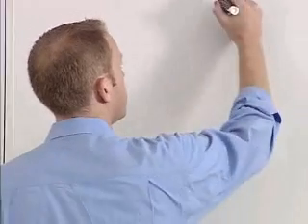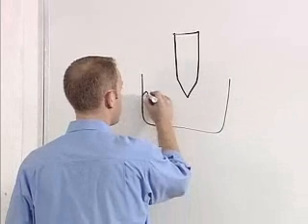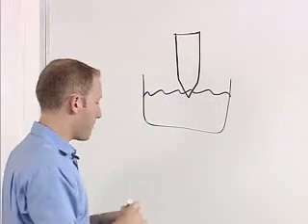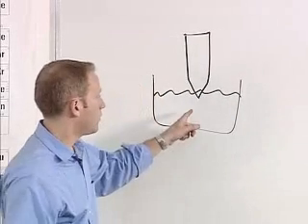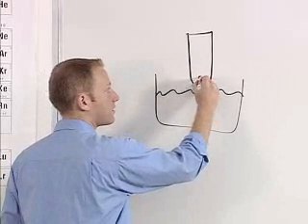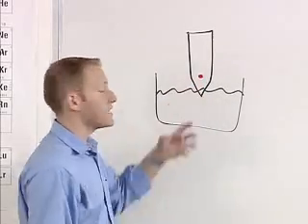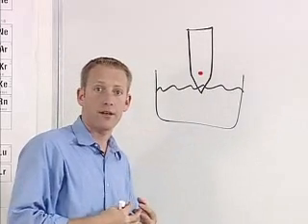And the last thing you need to know about is chromatography. Chromatography is just a way to separate mixtures. And the way we separate certain mixtures is we take chromatography paper. And let's say we have a beaker of water. We dip the chromatography paper in, and let's say you want to separate ink. You put a little piece of the ink on, and different parts of the ink stick to the chromatography paper in different ways.